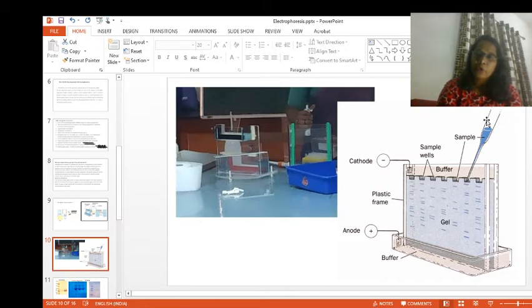For loading protein, we mix our protein sample with the bromophenol blue solution, which contains beta-mercaptoethanol and SDS, two denaturing agents. In addition to that, we boil the sample so that it denatures completely, and then we load the sample into the wells. Once the sample is loaded, we connect it to the power supply.